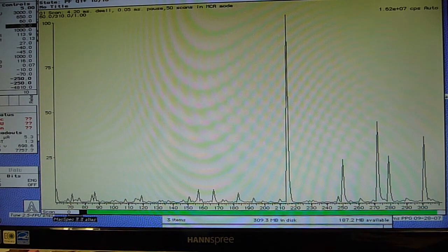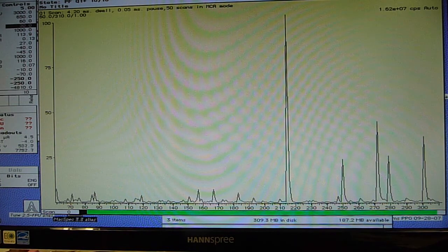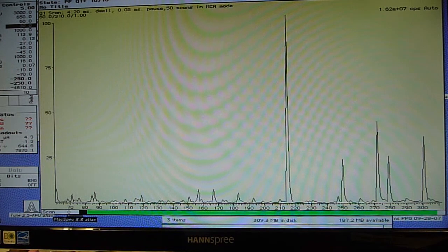This is the electrospray mass spectrum of sulfapyridine in methanol solution. Pretty dilute sulfapyridine, this concentration is roughly 35 nanograms per microliter, that's 35 micrograms per ml. This solution is aged roughly two weeks and the mass spectrum of the aged solution is definitely different than the mass spectrum of the nice fresh solution from two weeks ago. So we're going to use some MS MS and get some more information.